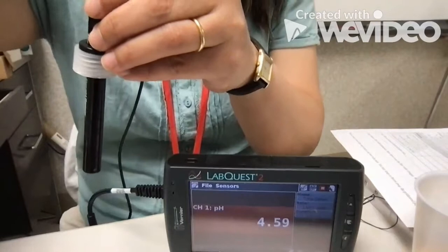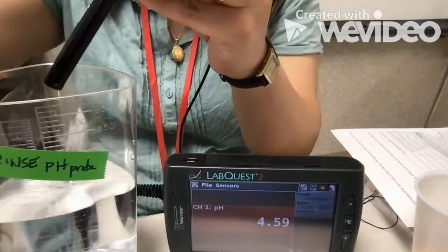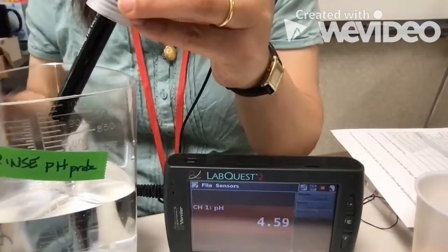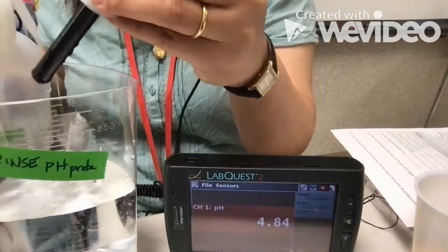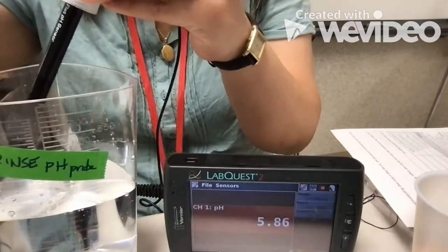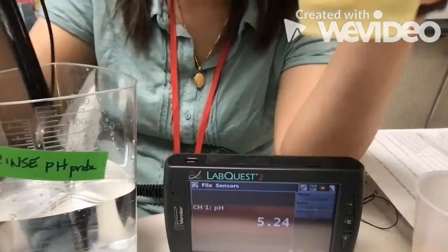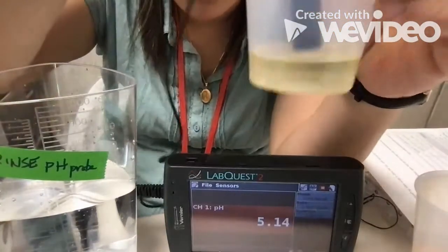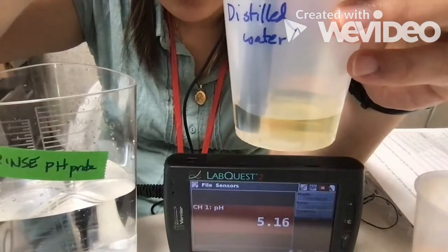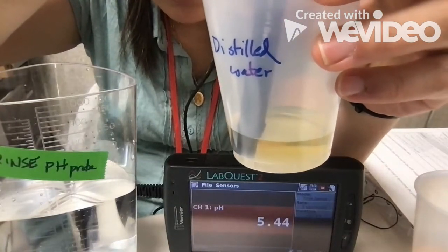Before we do this, though, we have to rinse our pH probe with distilled water each time because we don't want the solution from before contaminating our sample. All right, so the first thing that we're going to test is the distilled water. I'll put the probe in there and then take a look at what the pH is.